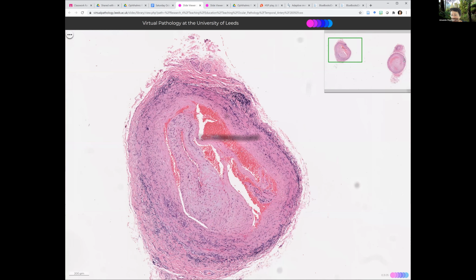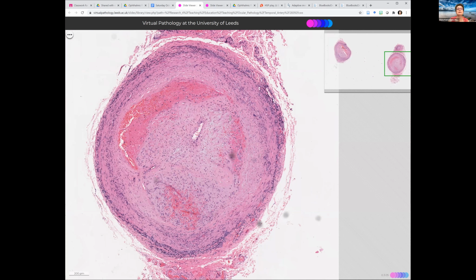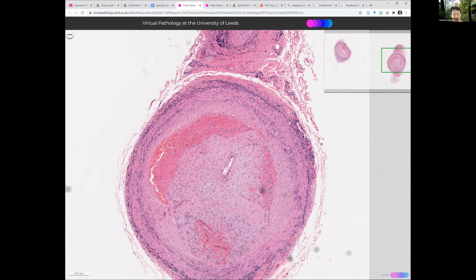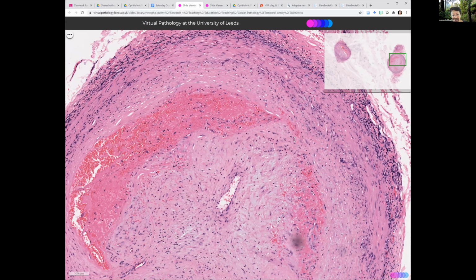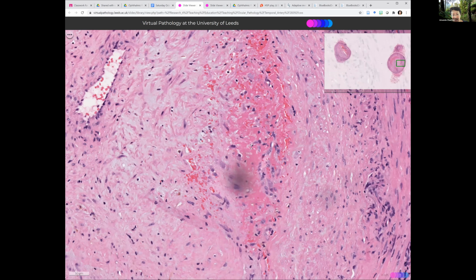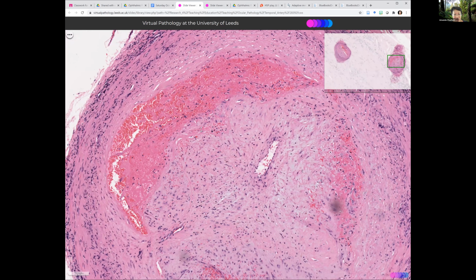More questions? What are the questions I had to answer? Can you call it a thrombus just because you see red cells in the lumen? Well, red cells in the lumen are normal, right? So these are not just red cells; it is a combination of things. Let's look over here, for example. We have a few red cells, but you see this pink amorphous material. I think this is probably fibrin and organizing degenerate red cell material. So this is an organizing thrombus to me. Over here, there are red cells and there is fibrin, and it appears to be organizing.